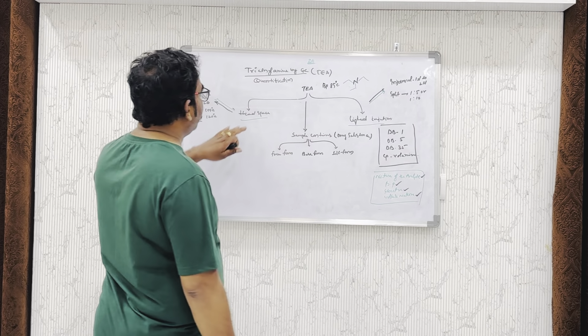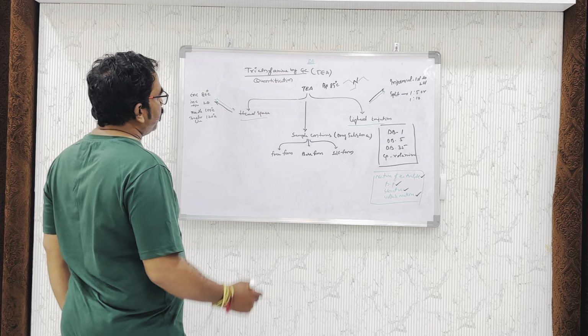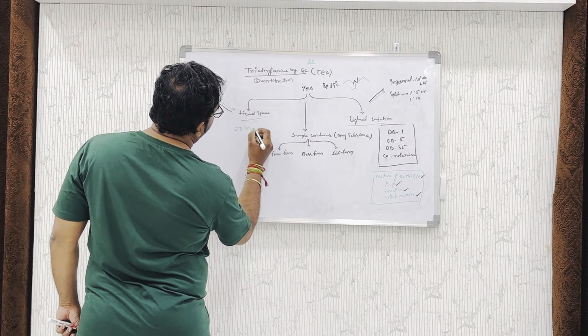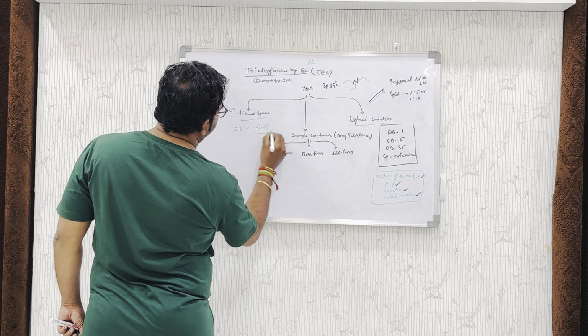For example, when we are analyzing by headspace, we can take the sample or standard and dissolve it in NMP. The NMP means N-methyl pyrrolidone.